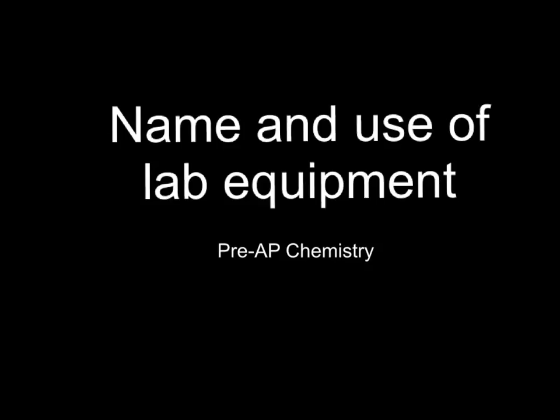In this video, I'm going to be talking about all the different lab equipment you're going to be using in pre-AP chemistry, what it's called and what it's used for.